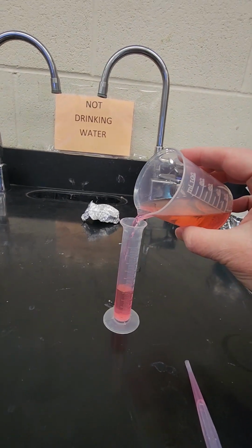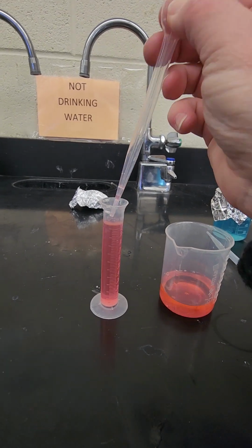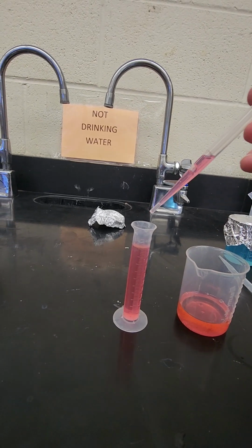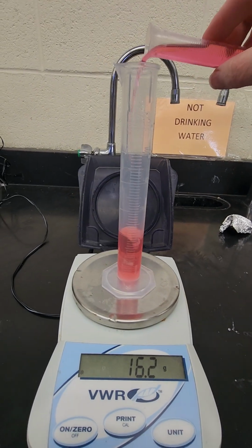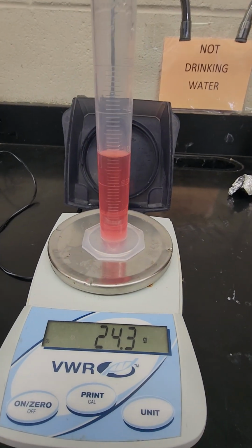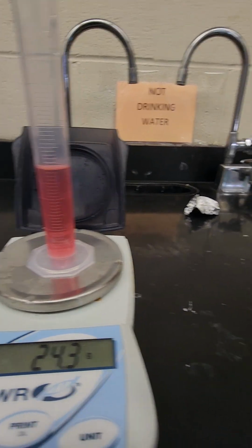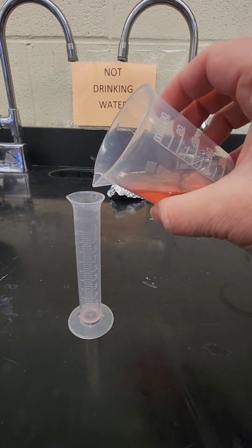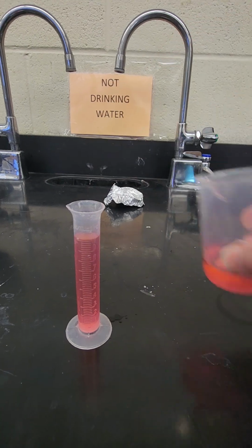And again, I'm going to pour another 10 milliliters in. I went a little bit too much this time, so I'm going to take some out using the pipette. It's right at about the meniscus, and I'm going to pour it in. My mass now is 24.3, and this is 30 milliliters. So you can see I'm going up by 10 milliliters every single time, and the mass is increasing every single time.